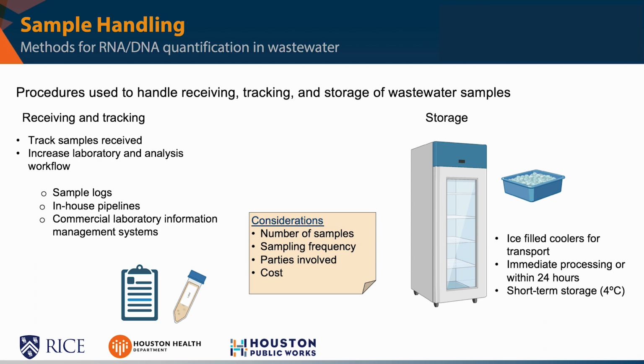Some strategies used to receive and track samples include the use of sample logs, in-house pipelines, and/or commercial information management systems. Sample tracking approaches can vary per lab and largely depend on the number of samples processed, sampling frequency, the facilities and personnel involved in the wastewater surveillance system, and the budget allotted for sample tracking and data management.